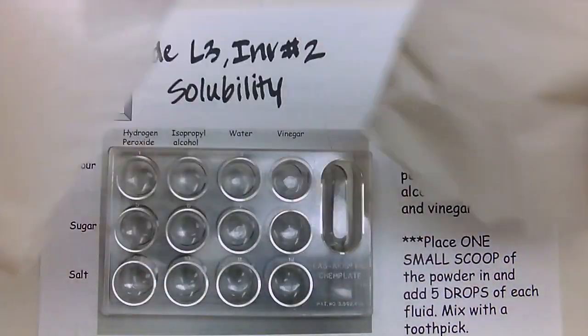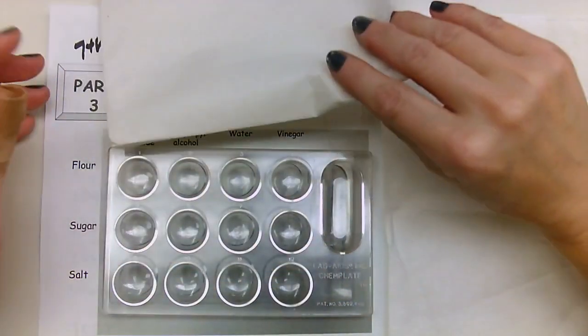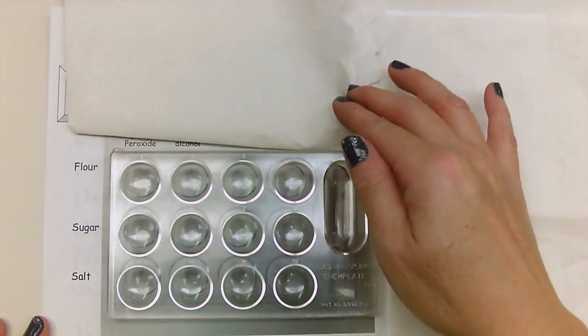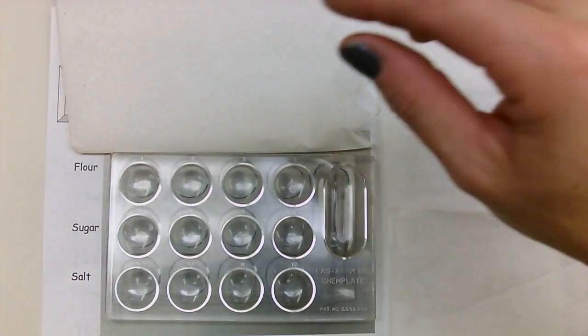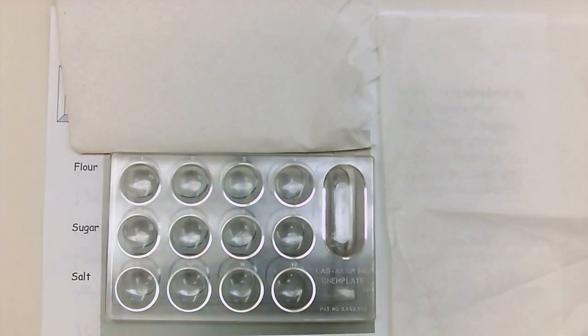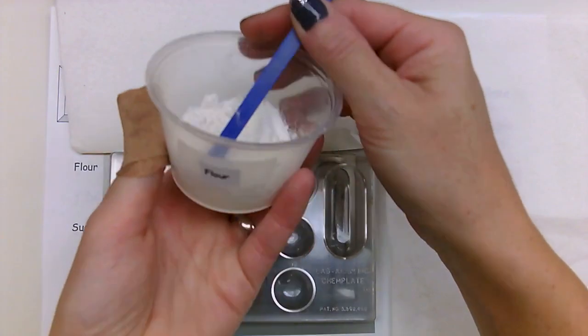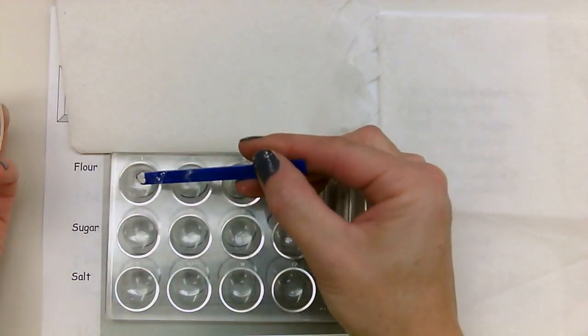mineral oil. Okay, so let me cover up these instructions so I can get started with the first example. So our first example is flour. So you have a little cup of flour. It says flour. And you're going to put a tiny little scoop into the flour.